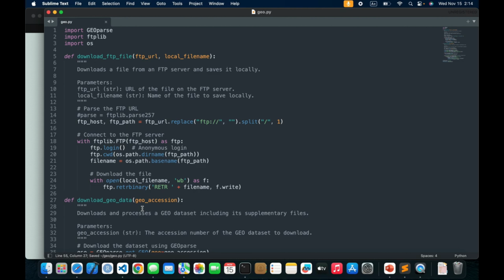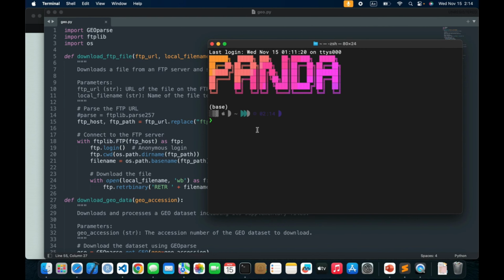And if I call this from the terminal, the command would be to access this particular Python code. So we have to go to the directory. This is the directory, and if you ls, this is the Python code, which has the extension .py. If you write Python 3, or maybe just Python, because the default is Python 3, you can call it as python geo.py. So this is how you can execute the Python script.